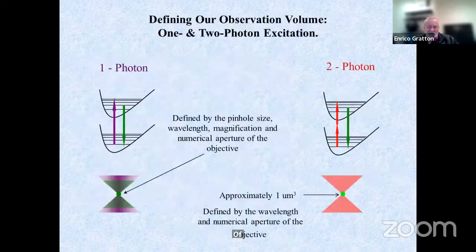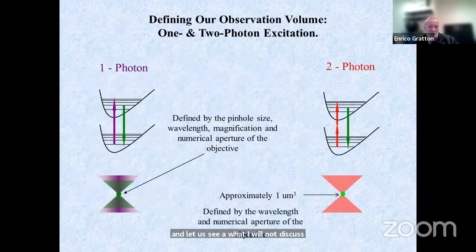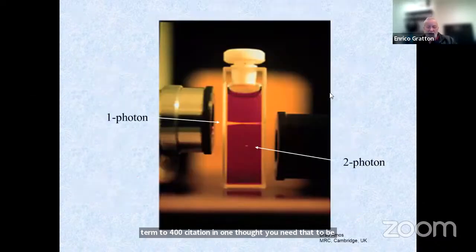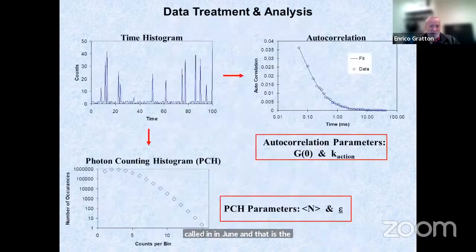And let us see, well, I will not discuss one photon and two photon excitation. In one photon, you need a pinhole, and in two photons, you don't need any pinhole. And that is the same slide I think that Lionel showed before.